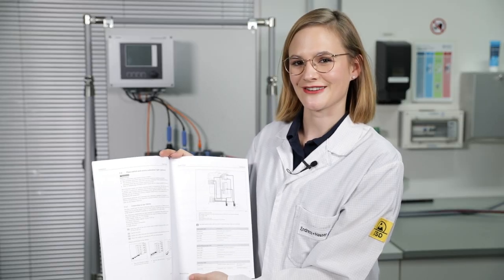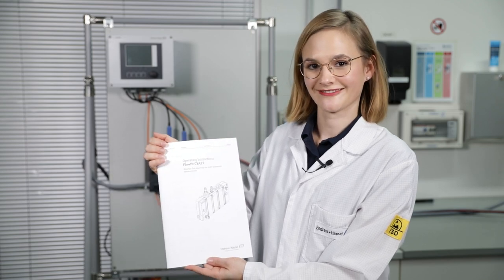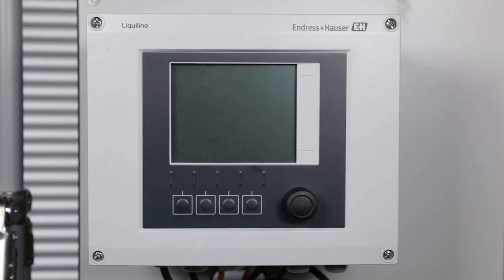A detailed illustrated instruction can be found in chapter 5 of your operating manual. Now plug in and power up the Liquiline transmitter.